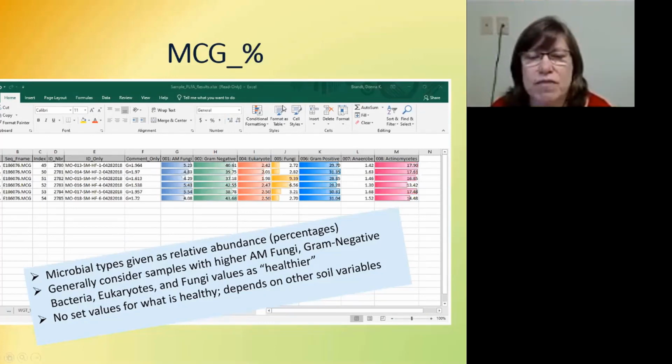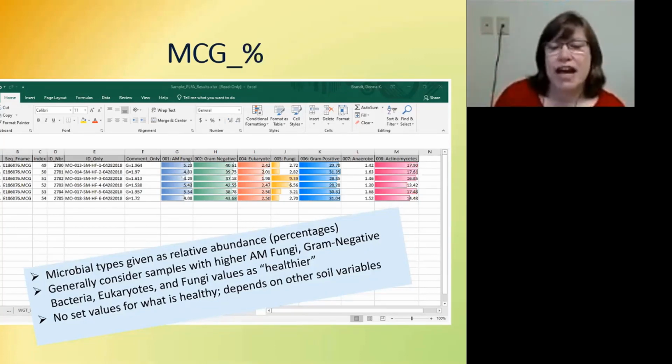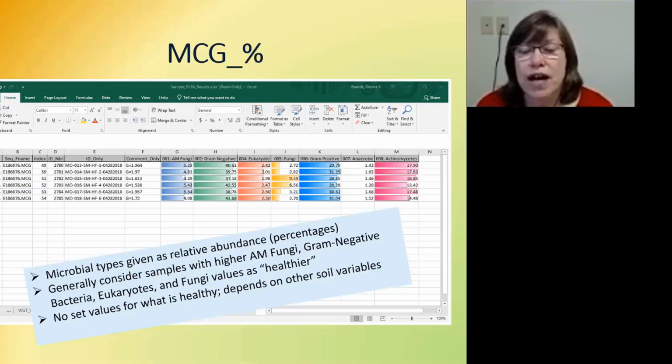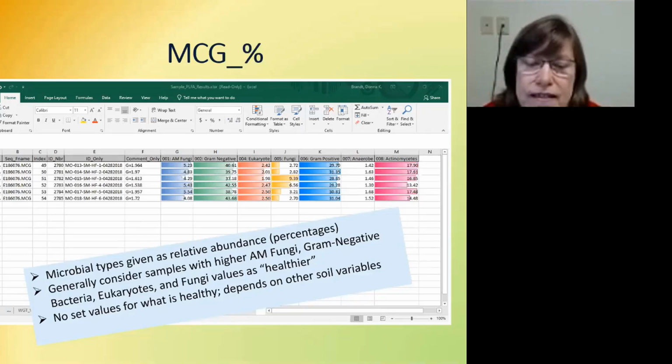So you see they've been much more equalized, and what's another thing that's kind of interesting, the fifth sample, the one that has the lowest amounts, actually, if you look at the mycorrhiza, the relative abundance is one of the highest, or the highest. So it may not have that many mycorrhizal cells overall, but because it has a lower number across the board, as a relative abundance, it's fairly high in mycorrhiza.